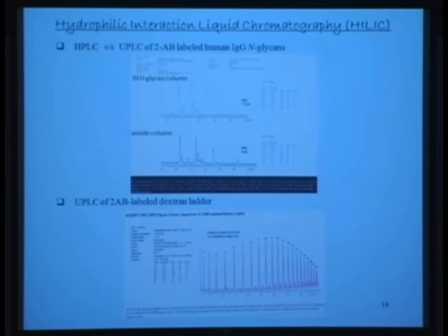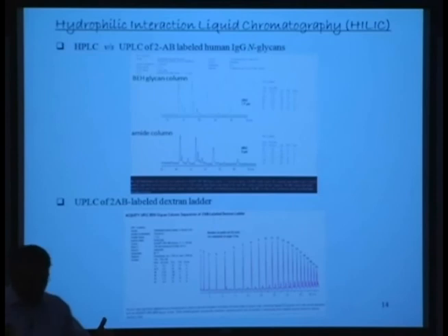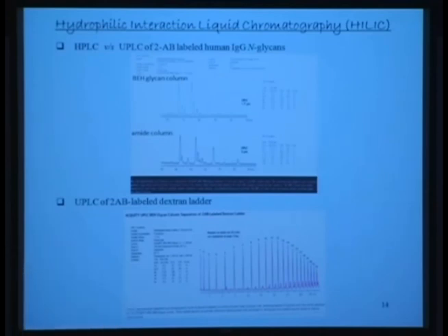So the trend these days, just to give you a dimension: HPLC columns, I don't know how many of you have seen them, you might have used them, are approximately this much. You typically use 15 centimeter, 20 centimeter, 24 centimeter columns. UPLC is just about this much. Okay, that's the size of the column length. Obviously, the pore is really much smaller. The separation is much faster, and I know you can't really see this well, but look at the column.